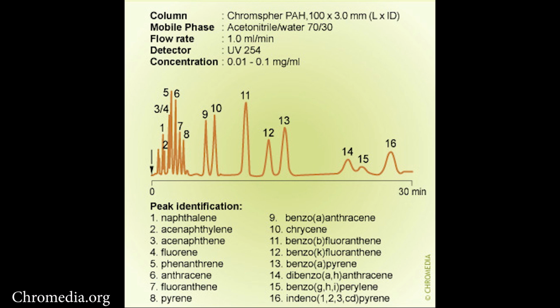So we have too much percent B. We have too much acetonitrile in the beginning, and we don't have enough in the end. We want the beginning peaks to spread out a little bit, and we want the last peaks to get pushed closer to tM. So we want to start at a lower percent acetonitrile, but then change the composition as we go through the run to allow those first peaks to elute resolved, and then those later peaks to get pushed off quicker.